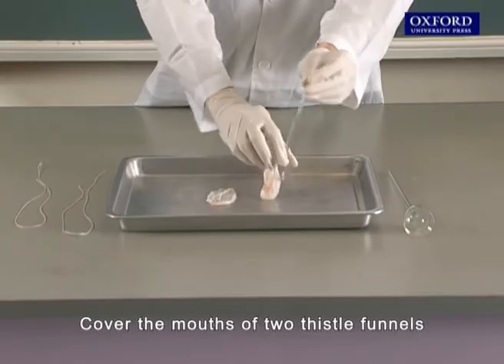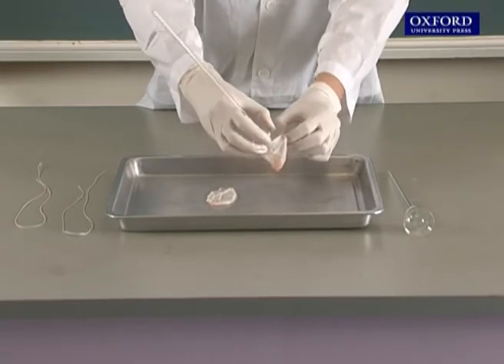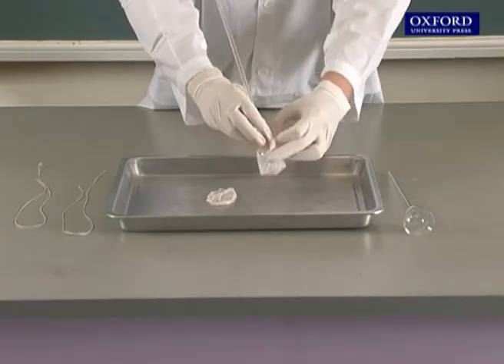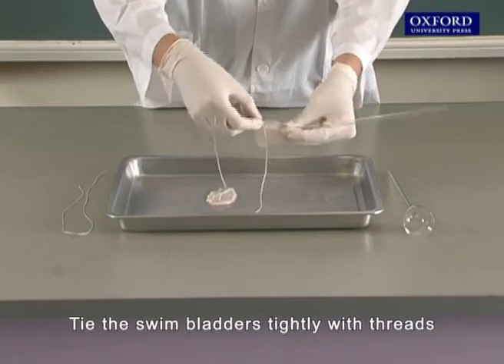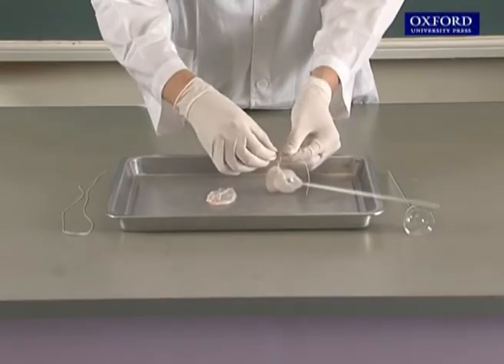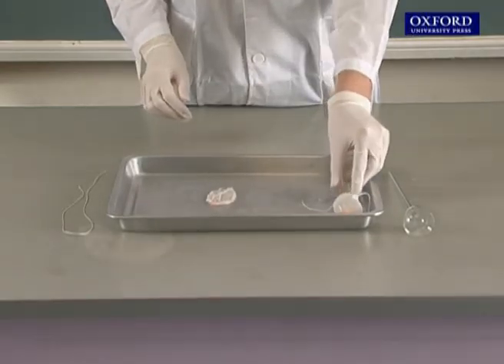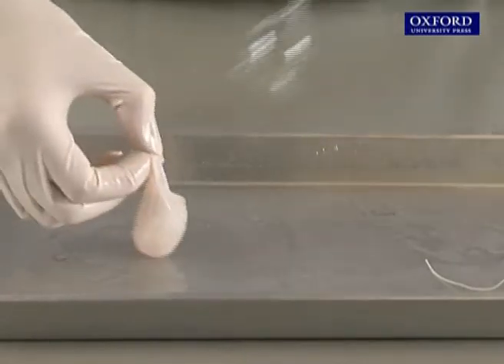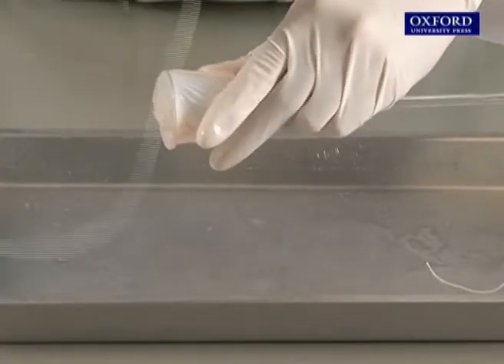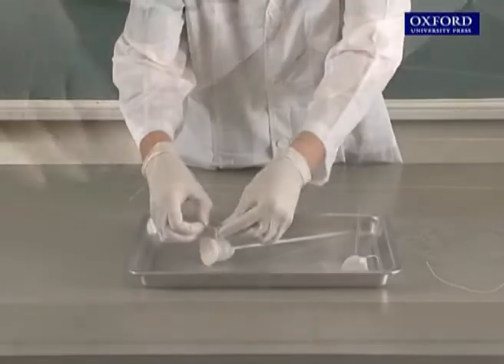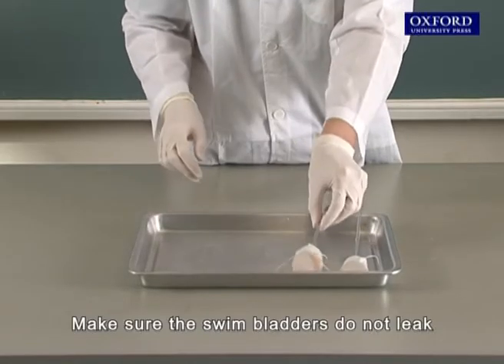Cover the mouths of two thistle funnels with two pieces of fresh swim bladder of fish. Tie the swim bladders tightly with threads. Make sure the swim bladders do not leak.